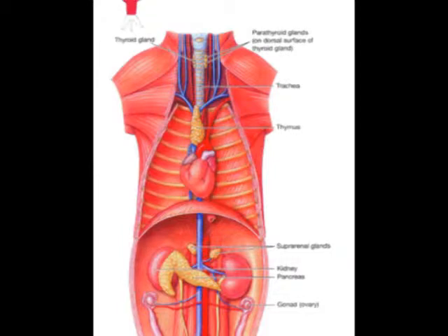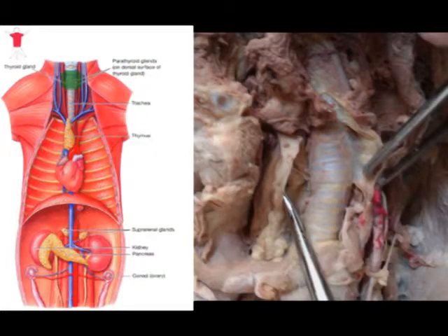The endocrine system is a system that produces and secretes various hormones throughout the body that aid in development and function of the body. It has the following organs. The thyroid gland controls how quickly the body uses energy, makes proteins, and controls how sensitive the body is to other hormones. It is hard to see because we damaged it.